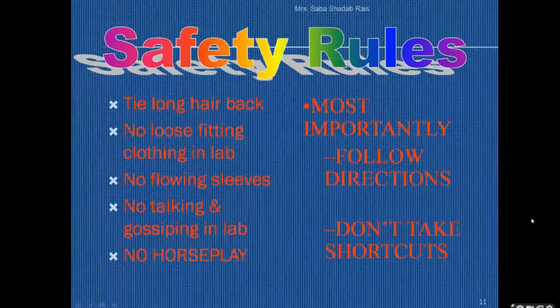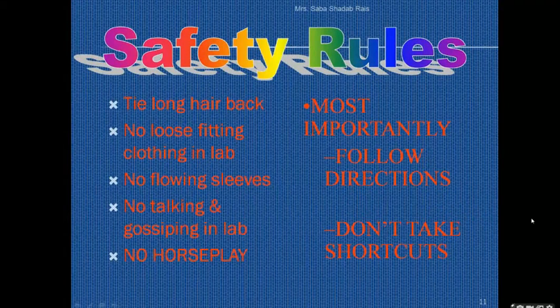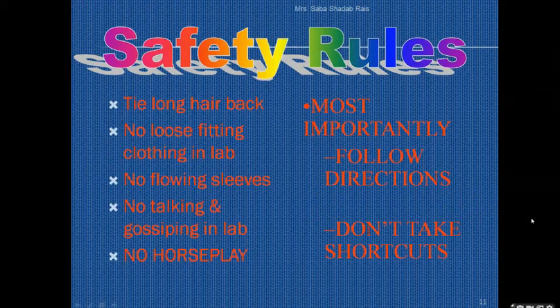Hence, contact of body parts should be avoided. You should not touch. Whenever you are entering the laboratory, make sure that you have your rough journal. It is compulsory. It should be maintained for recording the observations of whatever practicals you are doing, and it must be your regular practice. Only then do you transfer it to your fair journal.